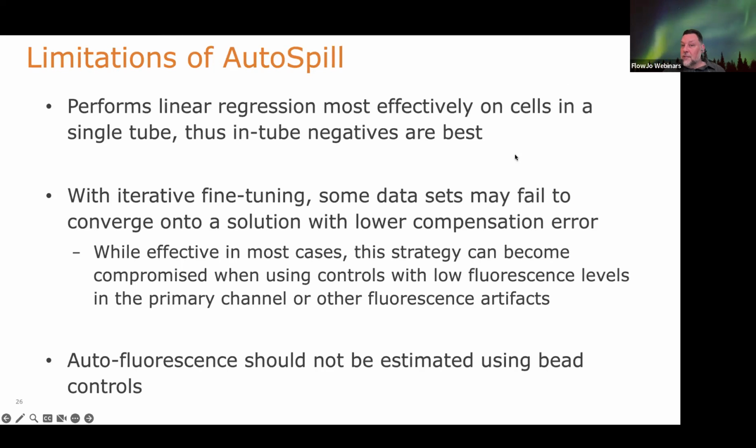I do have a question, which is: in higher dimensional panels, we've suggested to our users to match the cell type if you want to swap antibodies, noting that they are not tandems, using CD19 PE instead of a lower expression B marker, but this doesn't work with tandem dyes. So yeah, somebody is making a comment about Andrea's original question.